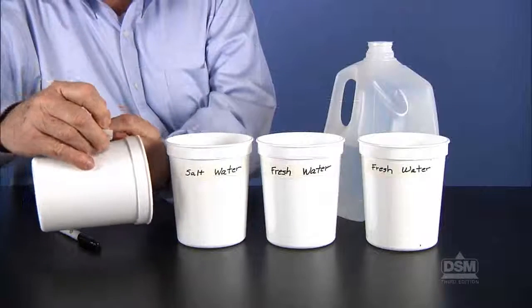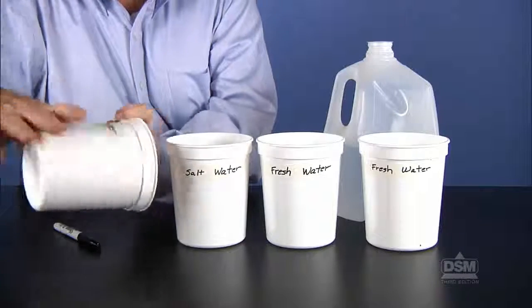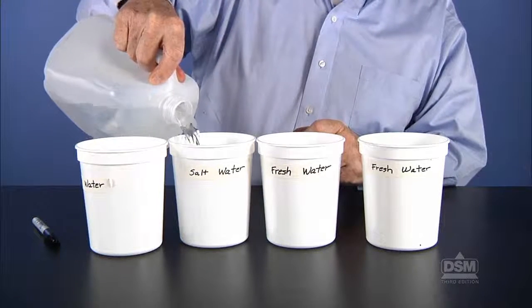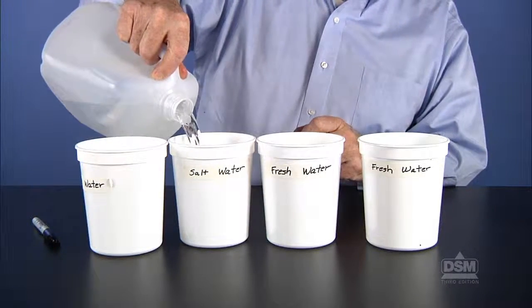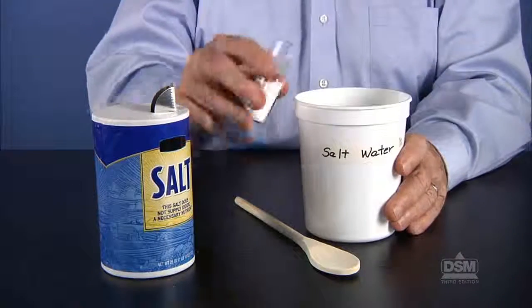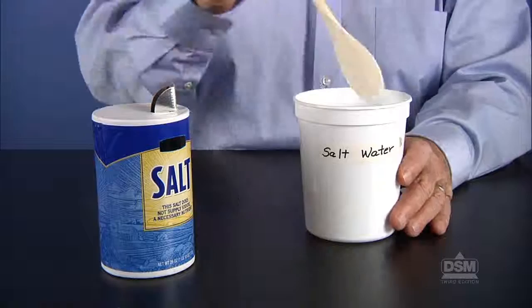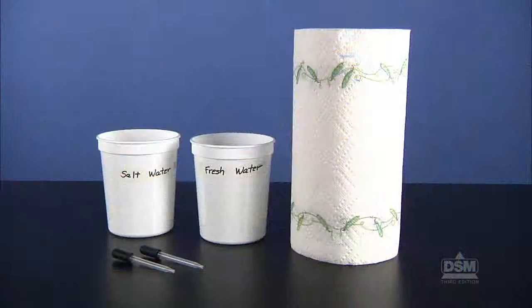Label 2 of the containers fresh water and 2 containers salt water. Place 1 liter of spring water into each container. Make a salt water solution, adding half a vial of non-iodized salt to the salt water containers and stir it well. Set up 2 distribution stations, each with the salt water and a freshwater container and 2 droppers for distributing the water. Have paper towels handy to mop up spills.